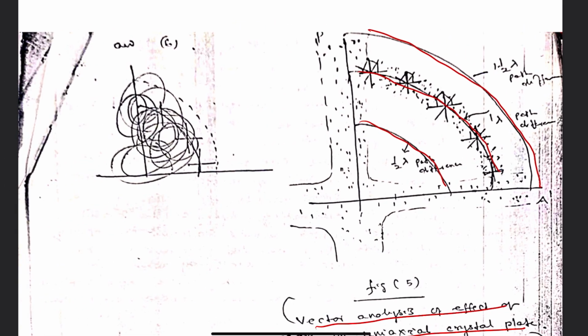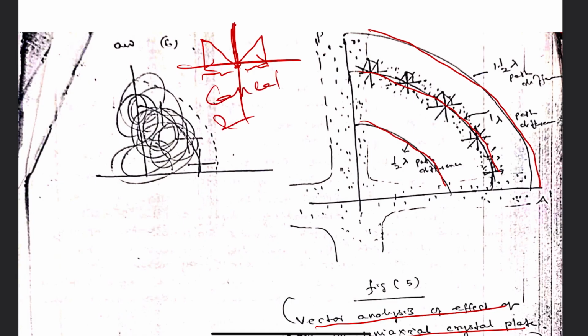So the case is like this. This is the amount of light coming from the polarizer, splits up into two rays in the mineral section. Their components in the analyzer plane, these are the two components, they vibrate in two opposite directions, they cancel and darkness results. This has been shown here.